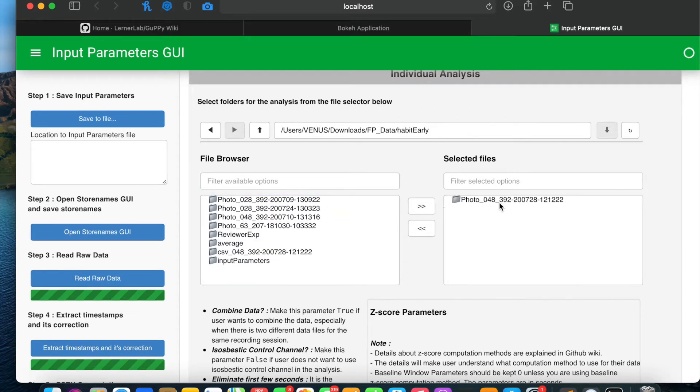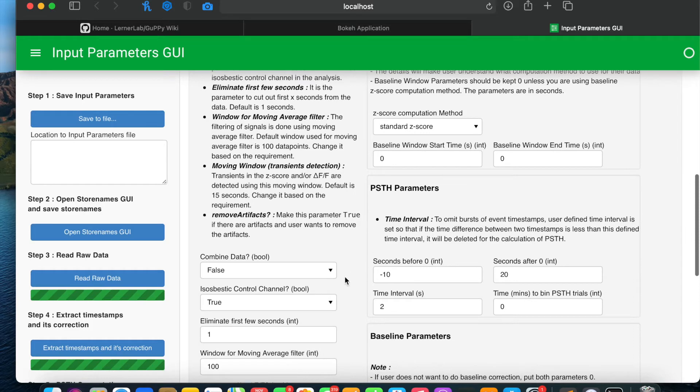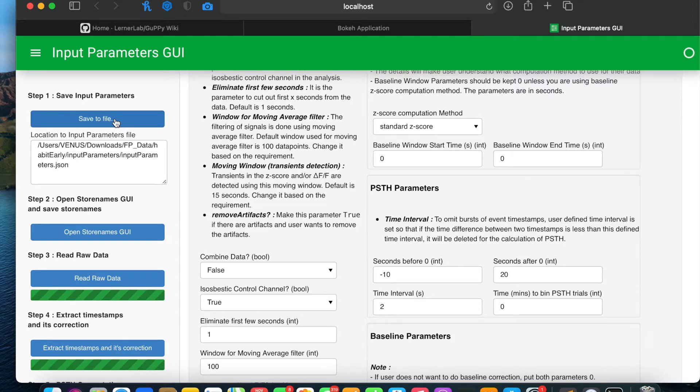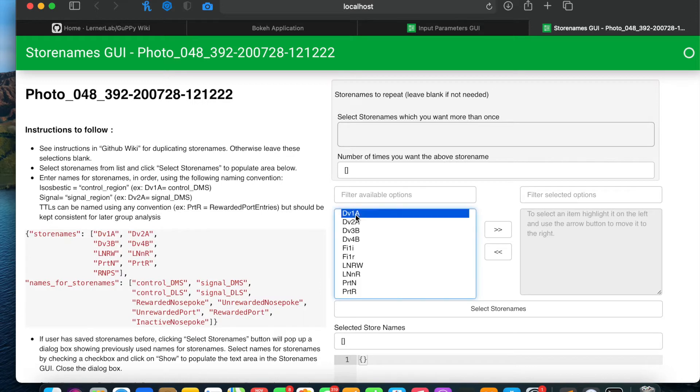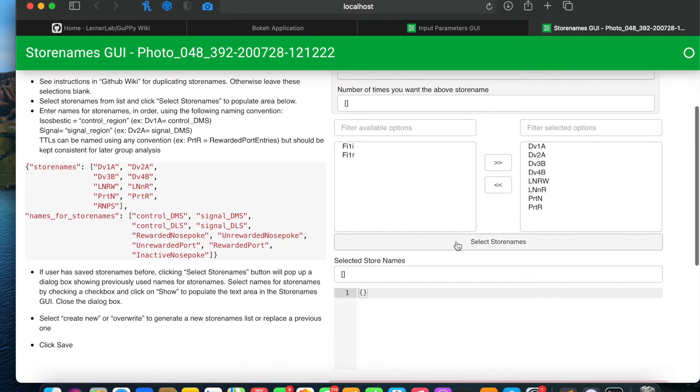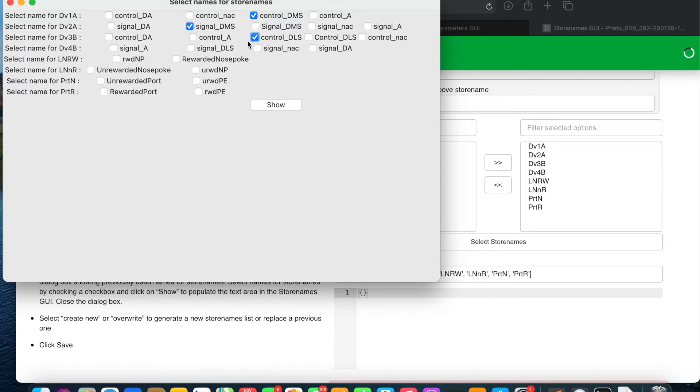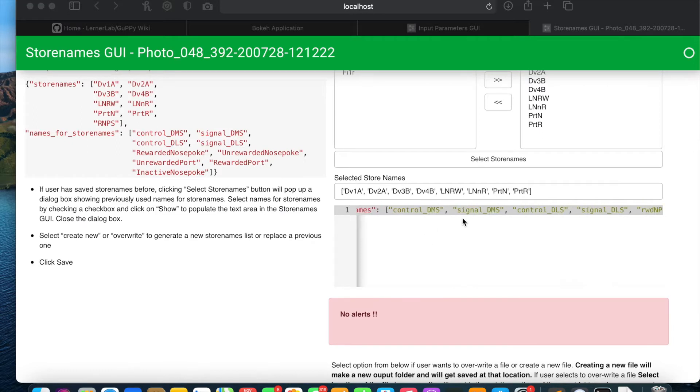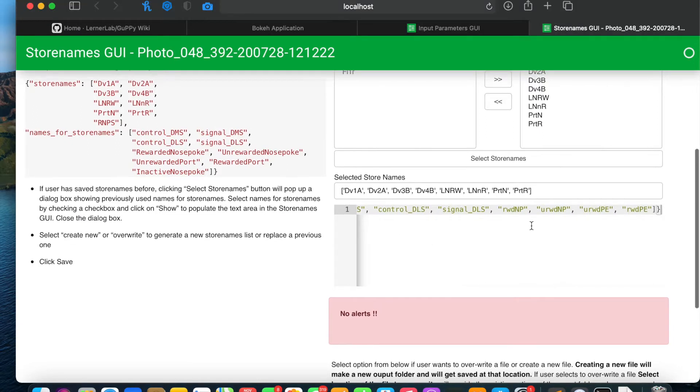I selected the folder in which there are artifacts already present. I will select the folder, keep all the parameters as default right now and save the input parameters to a file. Now I will open store names GUI and select all the store names which are required in my data. I have already shown this process in the individual analysis video. I will give a proper name to the store names and save it to a file.